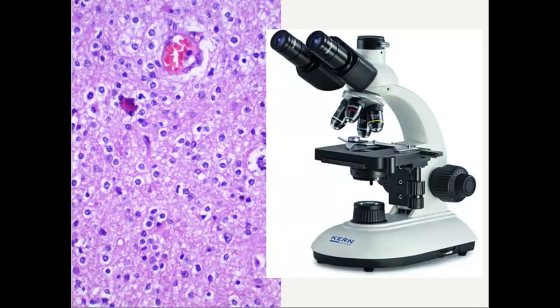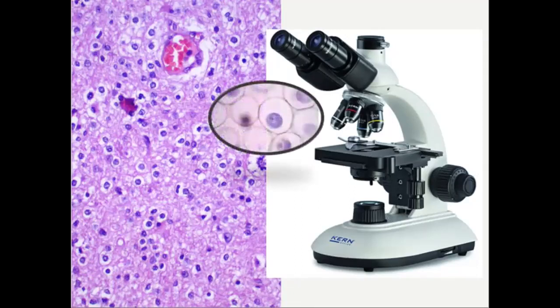And also, this is another advantage of the use of the light microscope, which is that you can see a wide area of a tissue. And using different magnifications, you can focus on a specific area and have a better view with more details.